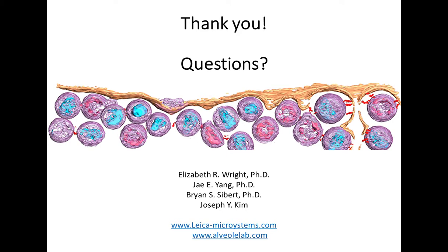This is actually an excellent question, and what I would say is that because the grids will be making contact with solution, regardless of whether it's in single particle or cell cryo-ET world, it is recommended that you indeed glow discharge your grids before it starts making contact with solutions of, say, the cell aliquot for which you want to seed your grids onto. So it's recommended that you glow discharge your grid right before the seeding process starts or before you begin micropatterning.